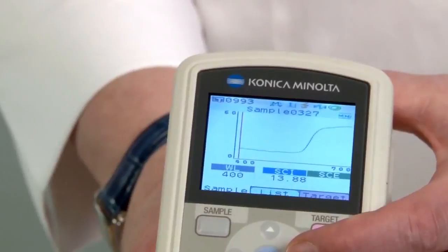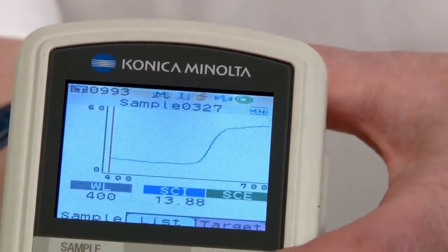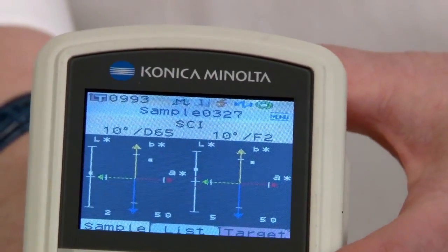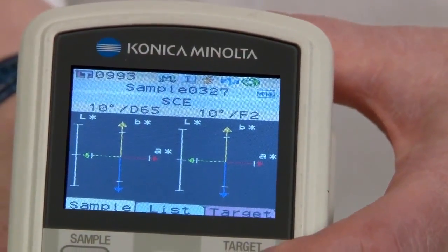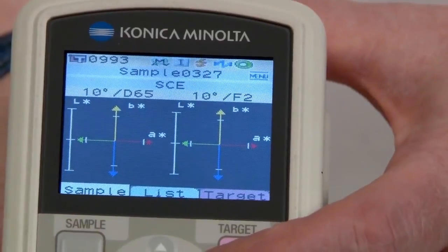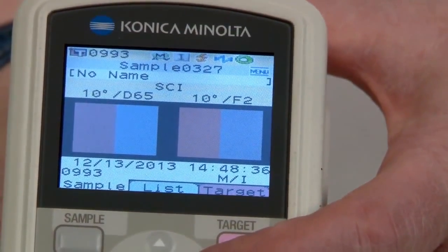During each measurement, data for specular components included and excluded are taken simultaneously to analyze the surface conditions, such as texture and gloss.